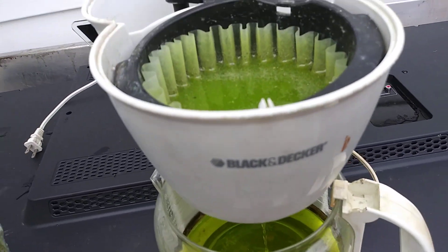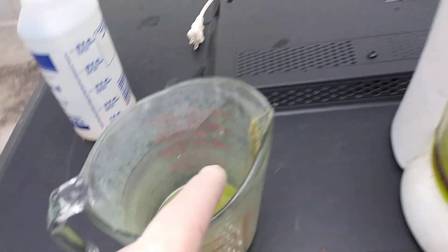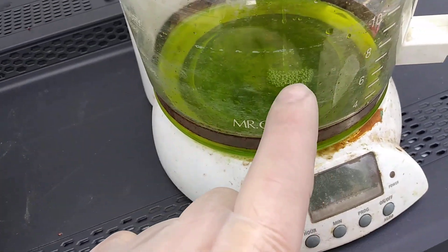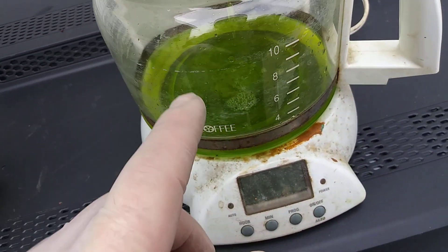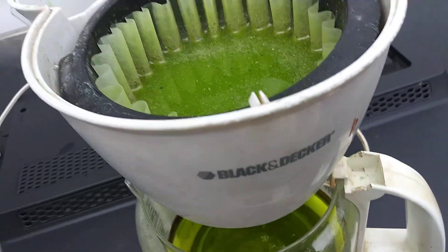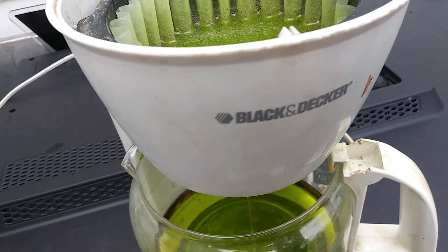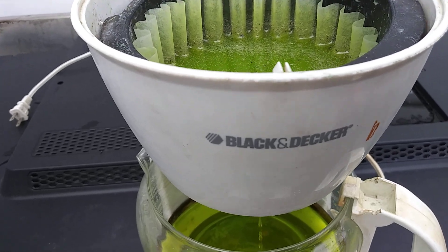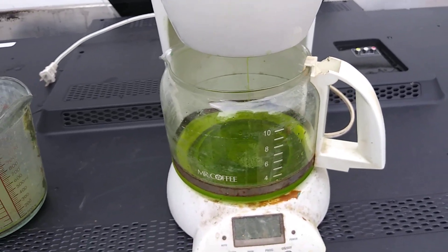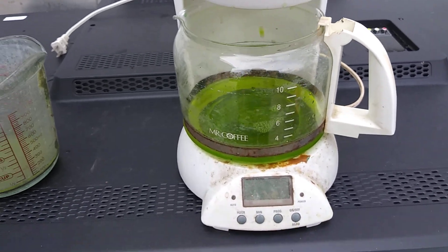I'll rinse this out, I'll rinse down the filter. The water will not hurt the solution, because the gold's in there — it's not going to hurt it at all. I'm going to rinse all this out once it gets done filtering. It's probably going to take 10 to 15 minutes. I'll come back with part three, which would be putting the SMB in there.